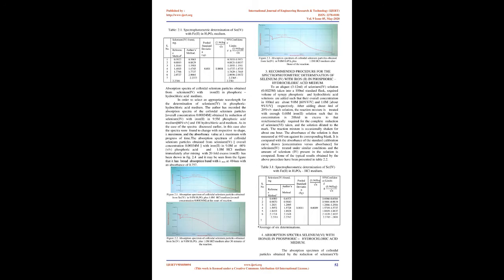1.3 Iron(II) solution. An approximately 0.60 M solution of iron(II) [43] has been prepared from an AR-grade ammonium iron(II) sulfate hexahydrate in 1 M sulfuric acid medium, and the solution standardized by titrating against a standard solution of dichromate [45]. In this method, iron(II) solution in 1 M sulfuric acid and 1 M phosphoric acid medium is titrated against a standard dichromate solution using barium salt of diphenylamine sulfonate as a redox indicator. From the solution, iron(II) solutions of required strengths have been prepared by suitable dilution.